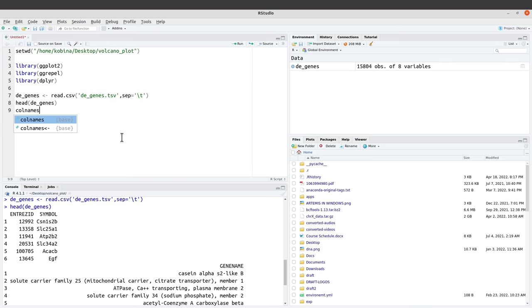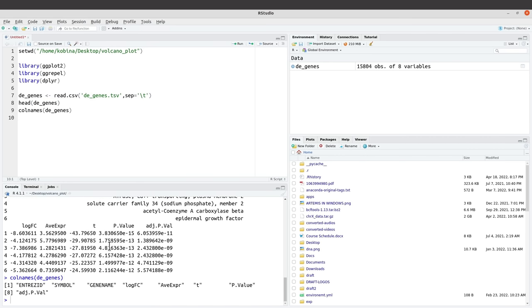I'll check the column names as well using colnames(degenes) — so we have them here. Whenever you are reading a file, one of the things you have to do is exploration. Exploration will help you understand the data and get information that will help you process it. That is why we do some of these things. Now everything is in place.